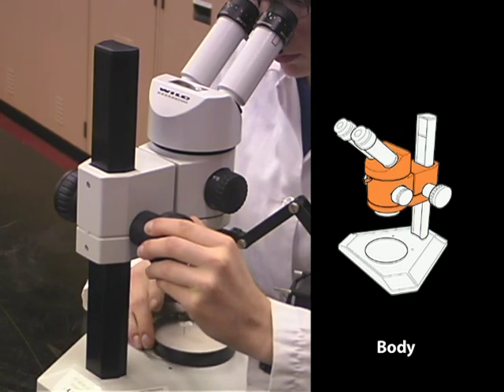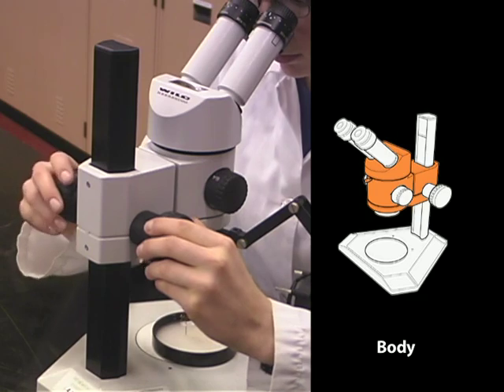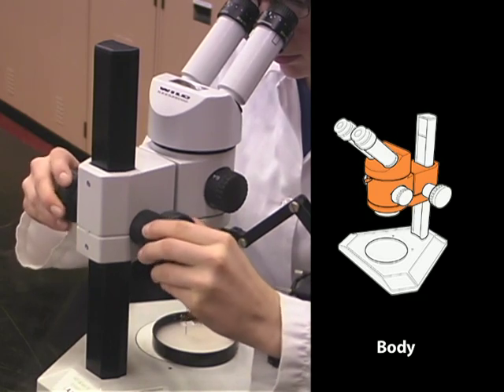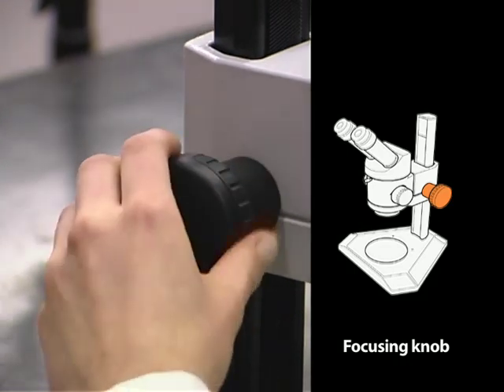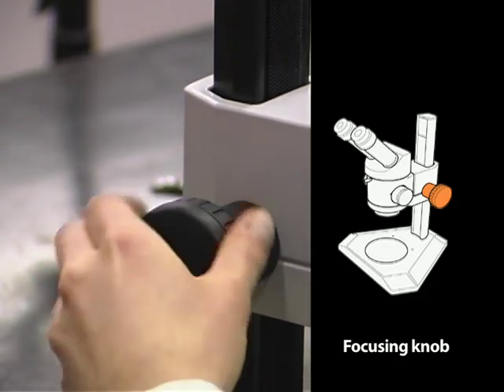The body of the stereo microscope holds the lenses and focusing mechanism. Stereo microscopes have only one focusing knob. With this knob, you move the body of the microscope closer or further away from the object.